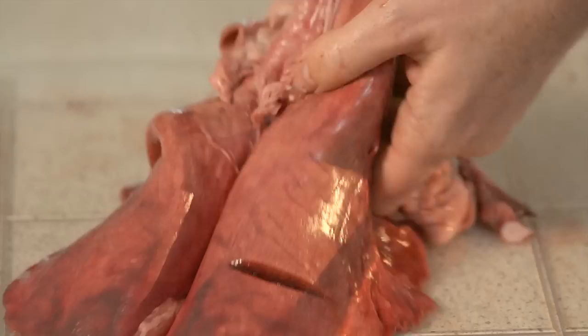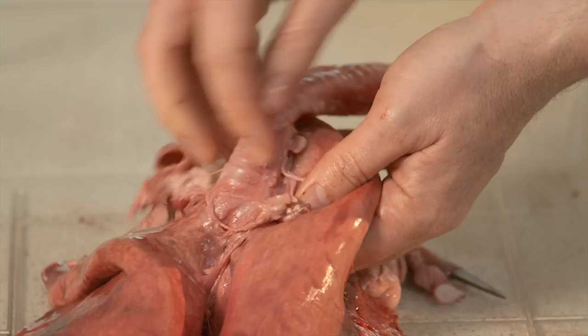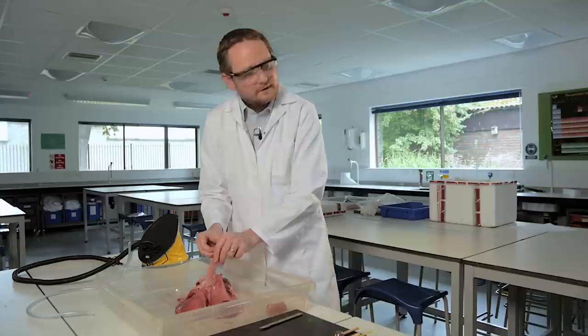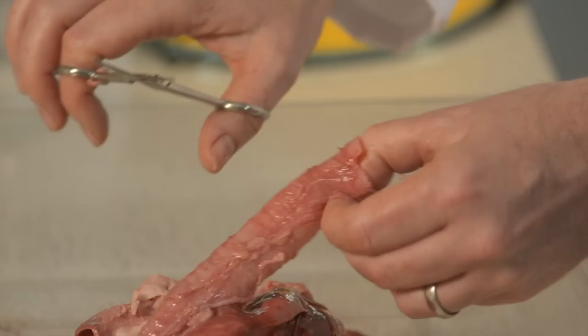We can start seeing the trachea is quite long and goes down in between the lungs down to a point here where it's about to bifurcate. So I think we'll cut down the rings of cartilage and see what we can see inside the trachea.